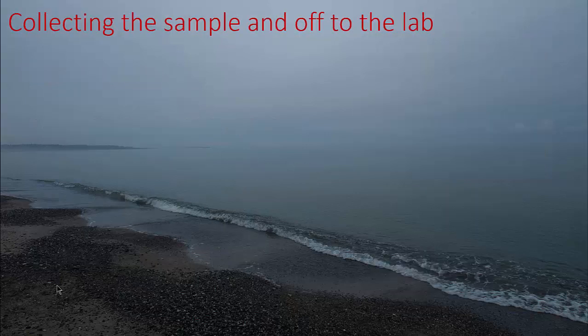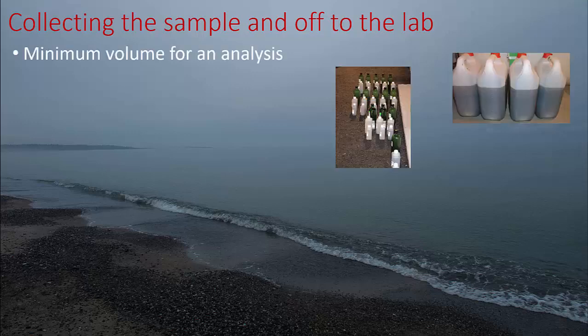Now we look at the sample vessels, collecting a sample and then off to the lab. Minimum volume for an analysis: depending on if you're doing metals or some organic substances, the volume can change dramatically. This you always need to check, and the best way is to check with the lab.